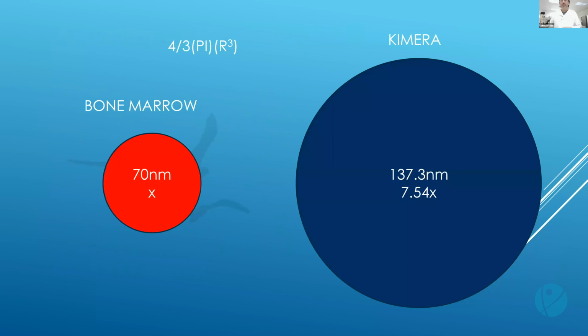This is what, if I just said that there are 100 nanometers, well, exosomes vary in size. Remember, exosome science is very novel. That's one of the reasons I'm in Oxford right now. I need a machine that can look at the exosome. I do not need to know just what the volume of the exosome is or what the size of a particle is.